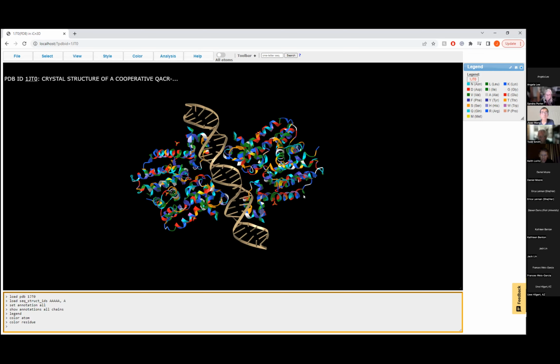I don't know, Sandy, if you have anything else. I think you said it pretty well, Todd. Also, I think what's nice about having the legends is if we look at proteins that have repetitive amino acid sequences, it looks kind of cool, and you can quickly identify what the repeats are. So there's a lot of information you can get out of it.